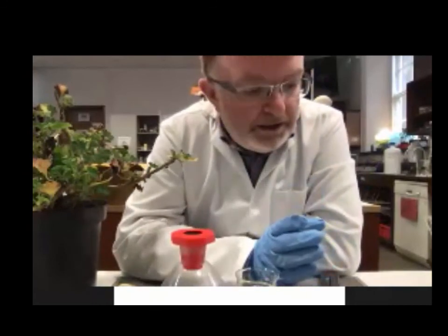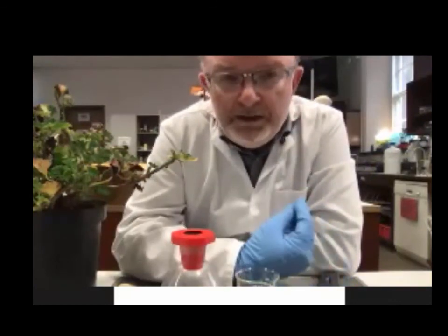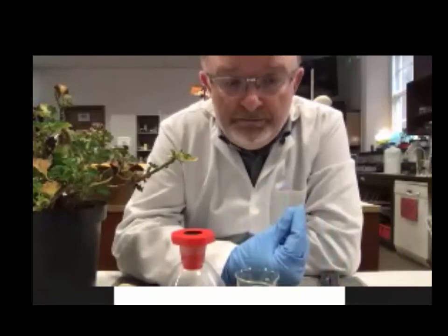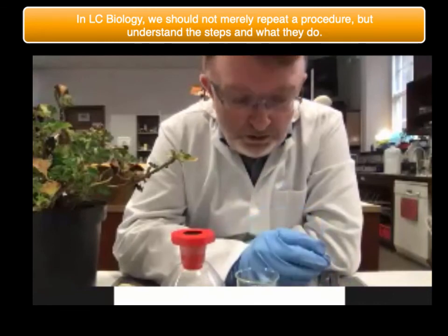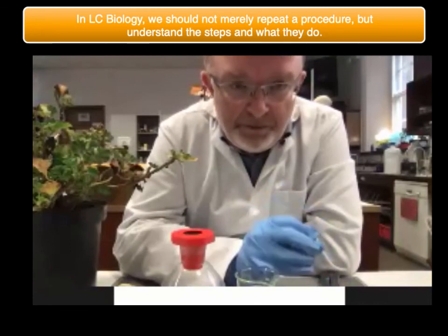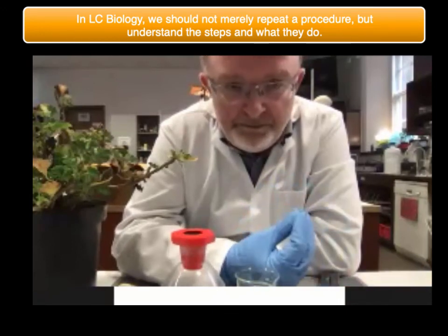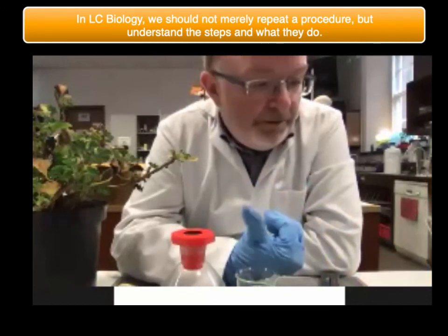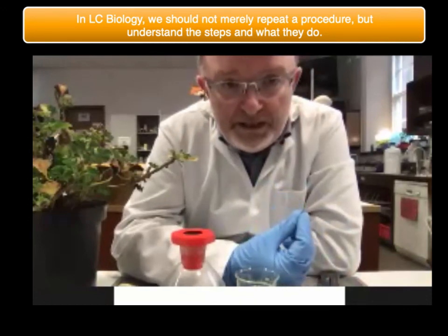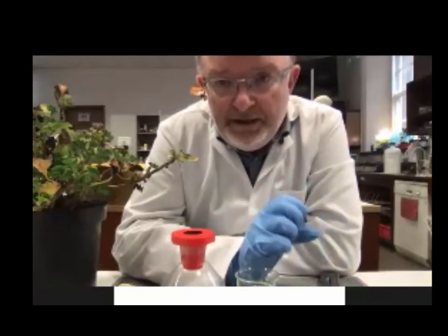So it's not just a matter of repeating this in a biology lab. It's about trying to understand what you are doing. You've got to break down the plant's walls, then the plant membranes, bursting out the DNA, because remember the DNA is bound inside membranes in the nucleus. The step I could have introduced there would have been to use a protease, but I didn't. And then precipitate out, because DNA precipitates in freezing alcohol.